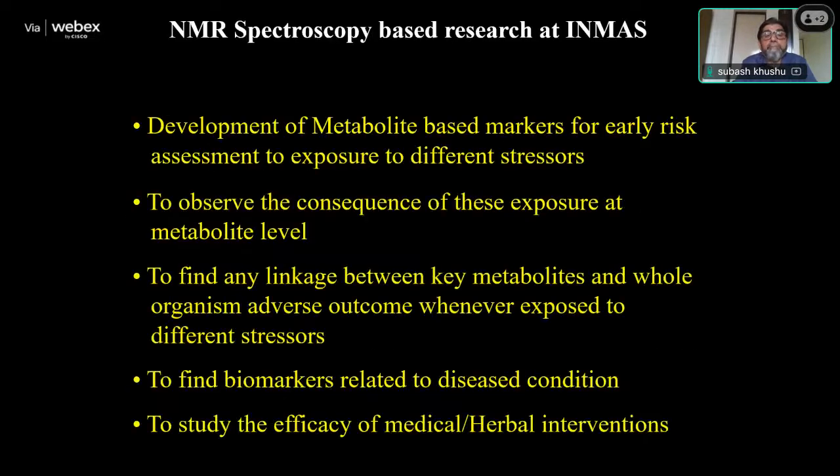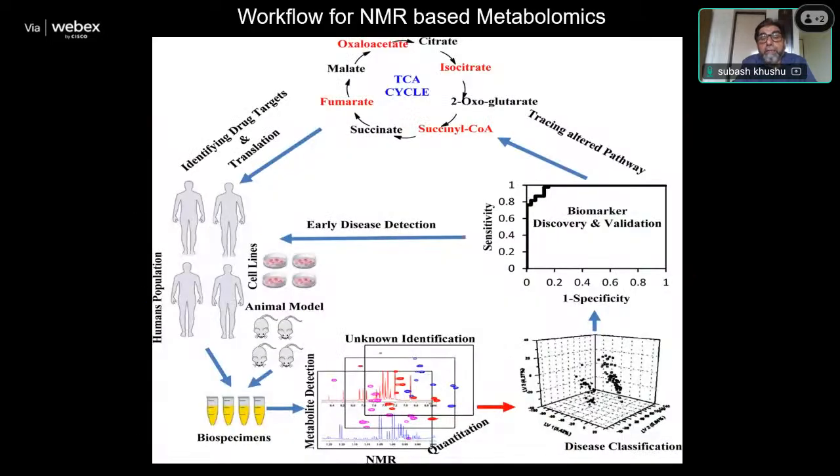So it is always good to give some good thought to an experimental design to have good experiments. And these are some of the applications which I want to show you regarding the studies which we have done, where you can use them as high throughput devices. So this is the complete workflow of metabolomics.